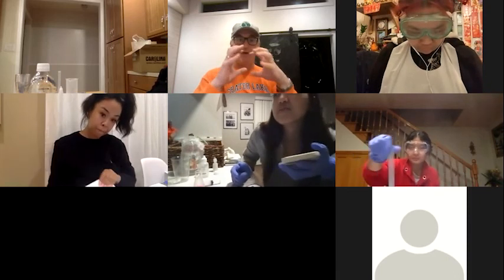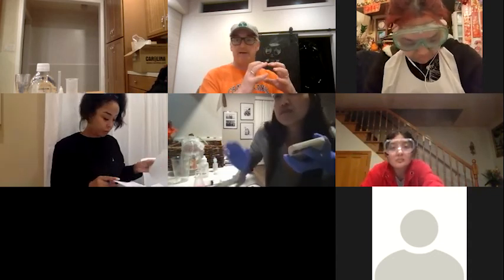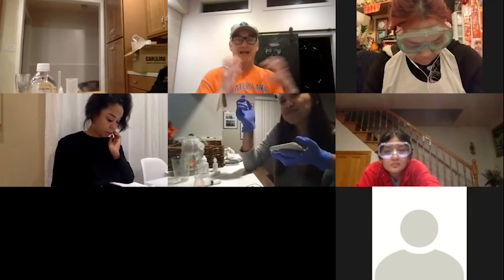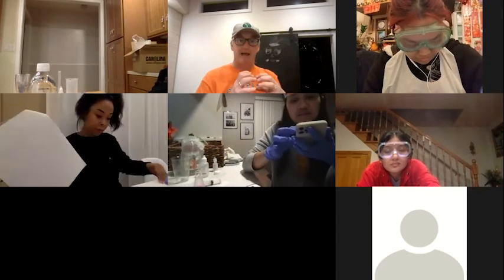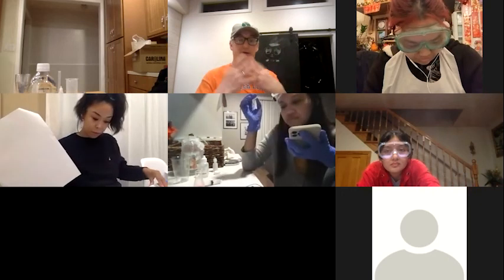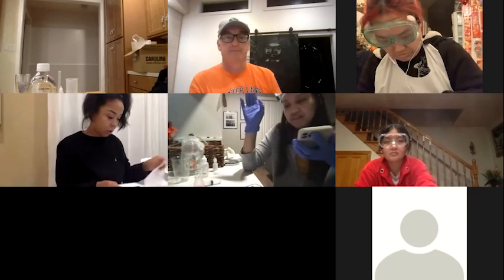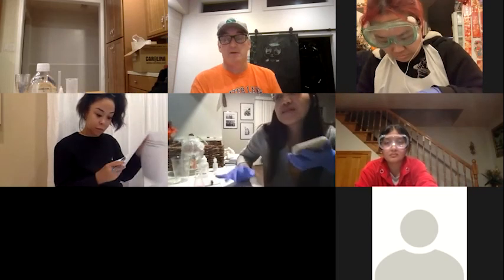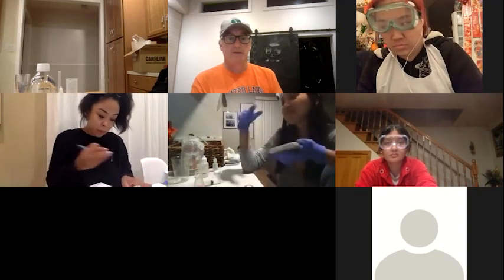So if you're taking grams of acetic acid and dividing it by grams of vinegar, which is what you measured in the first place, that's the ratio of mass of acetic acid and mass of vinegar. Multiply that by 100 and you get the mass percent, which in your instance is 4.6%. Is that bad? It's pretty close to 5, right? Yeah, so you're good.